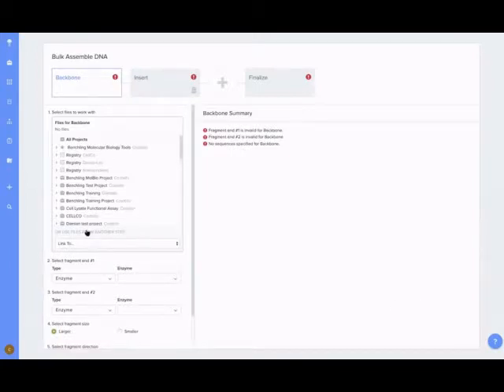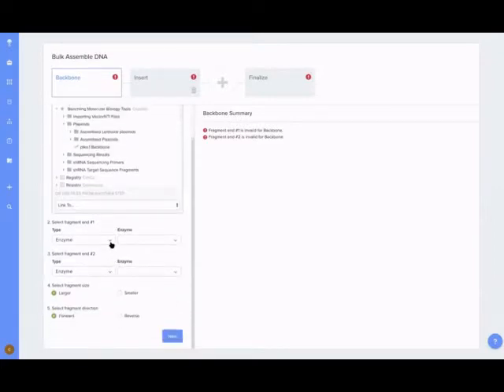So I can first start by selecting the fragments that I'd like to assemble. For example, in this case, you might remember that the requesting scientist asked that I use the PLK01 backbone. And then the next step is for me to select a fragment end. Another way that you can think about this is selecting your assembly method.